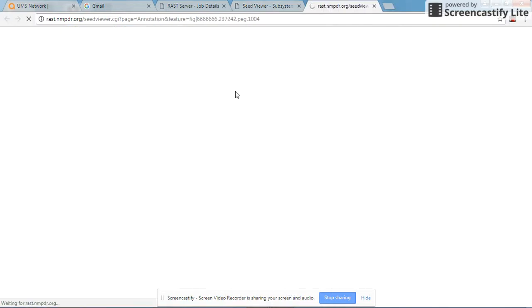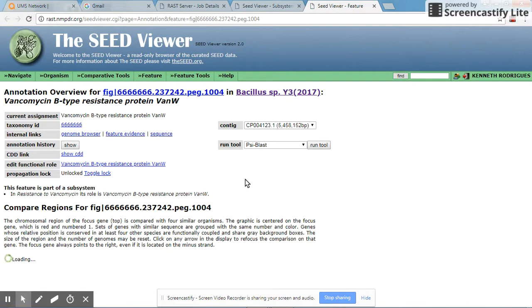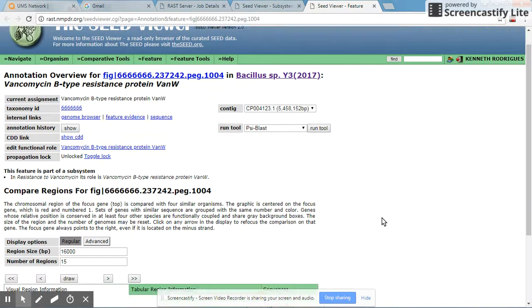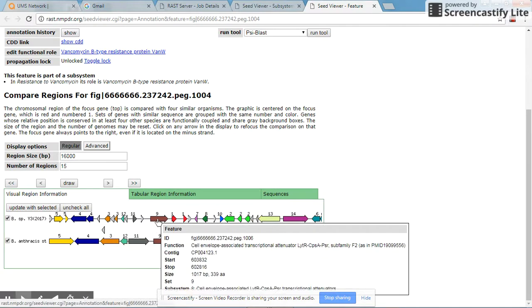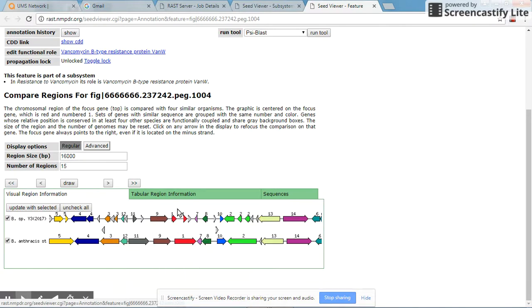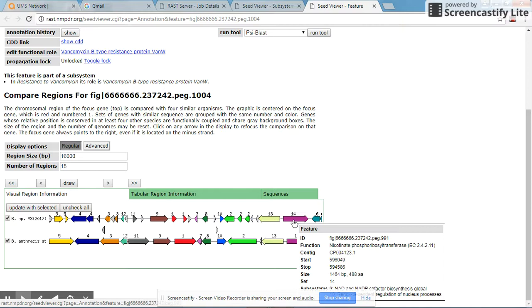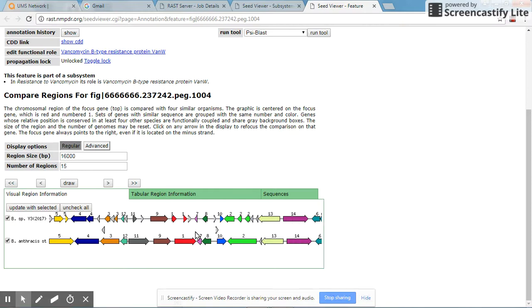I click on this icon for vancomycin resistance, and you will see the gene organization showing the 5' and 3' orientation. This shows you the specific genes associated with the actual gene for vancomycin resistance.